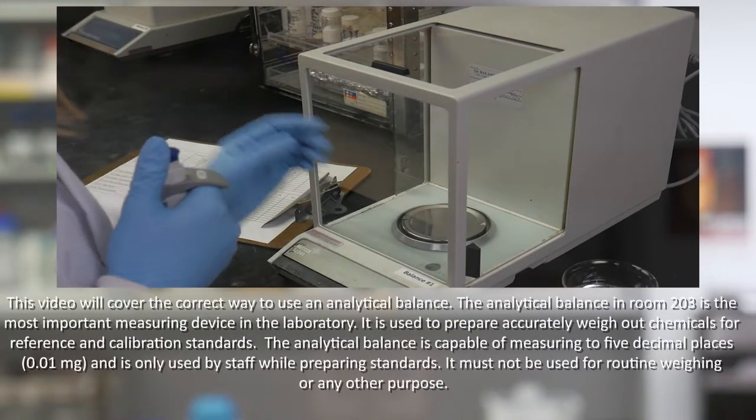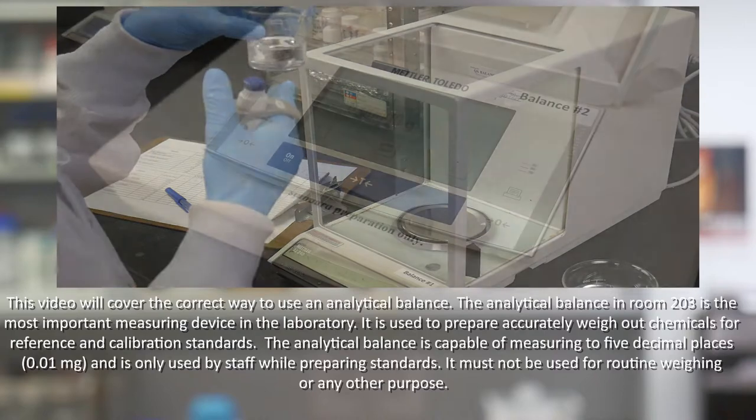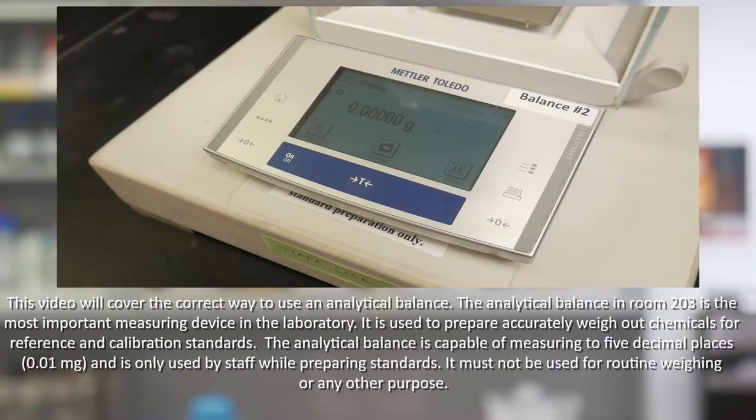This video will cover the correct way to use an analytical balance. The analytical balance in room 203 is the most important measuring device in the laboratory. It is used to prepare accurately weighed out chemicals for reference and calibration standards. The analytical balance is capable of measuring up to 5 decimal places and is only used by staff while preparing standards. It must not be used for routine weighing or any other purpose.